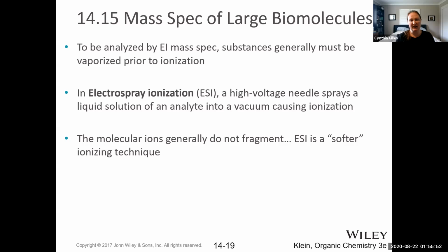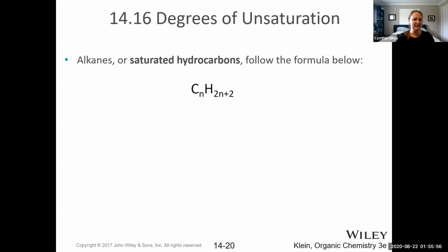And the molecules then have less energy, and so they're less likely to fragment. Okay, moving on from mass spectrometry, we're going to talk a little bit about something called the degrees of unsaturation, or the hydrogen deficiency index.